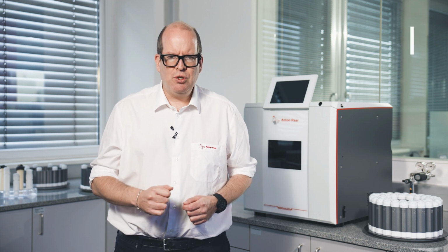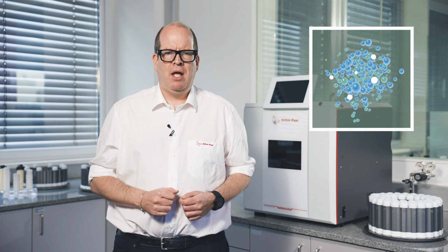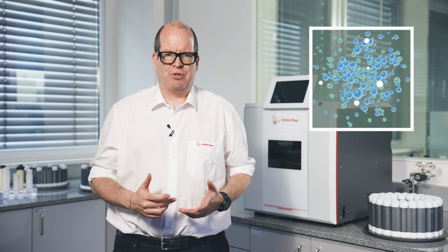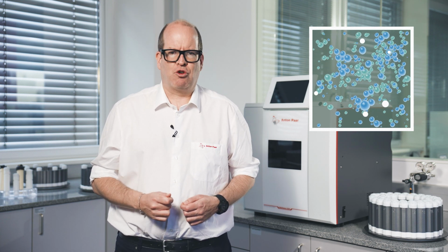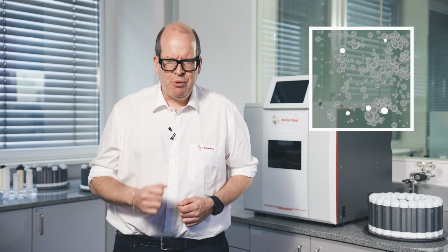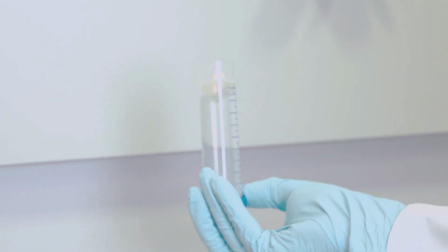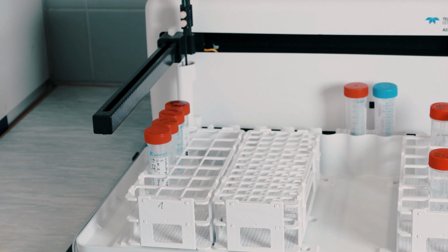For inorganic samples like metals, ceramics and minerals, this process is similar. The difference is that we usually need acid mixtures. We'll talk about that later on. And that after the digestion process, not only the trace elements remain in solution, but also the main components. In both cases then, you end up with a dissolution of your analytes. Ideally a clear solution without any solids, which can be measured via atomic absorption spectroscopy.